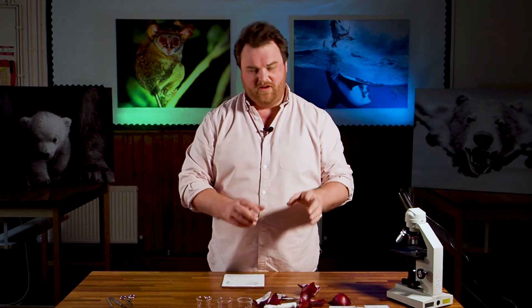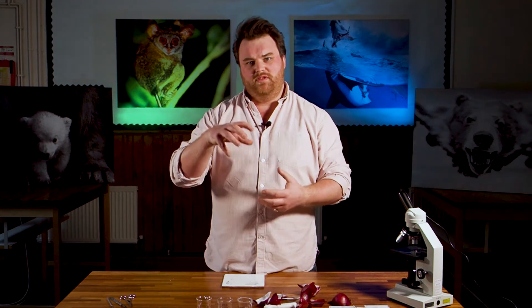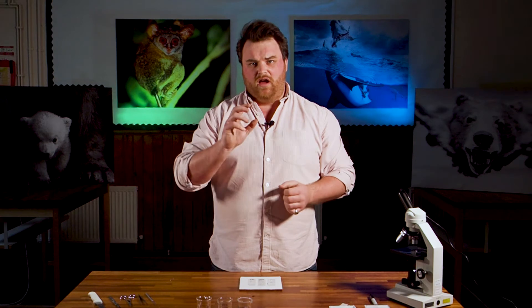We've got our onion epidermis. We're now going to make three separate slides of this — three little microscope slides — put them in three different conditions and see what happens to those cells. We've got three slides each with a piece of red onion on there.